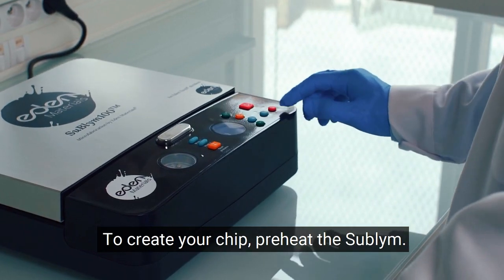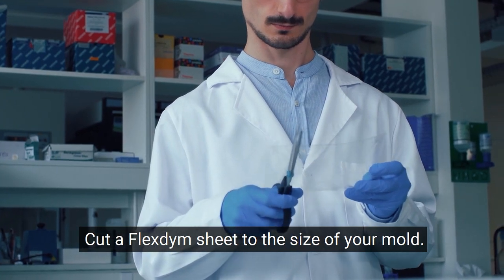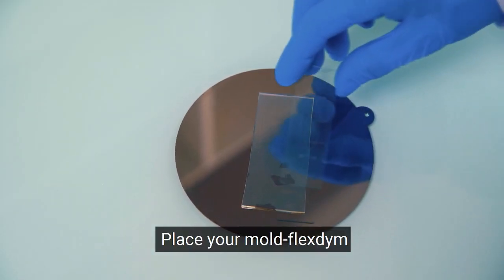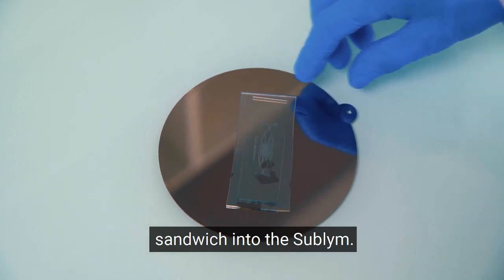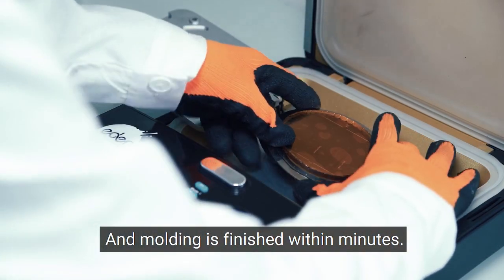To create your chip, preheat the Sublym. Cut a Flexdym sheet to the size of your mold. Place your mold-Flexdym sandwich into the Sublym. Different types of molds can be used here and molding is finished within minutes.